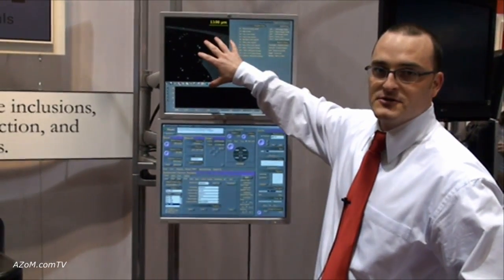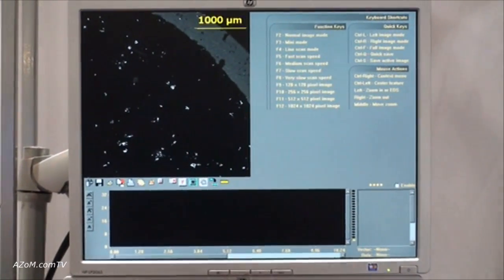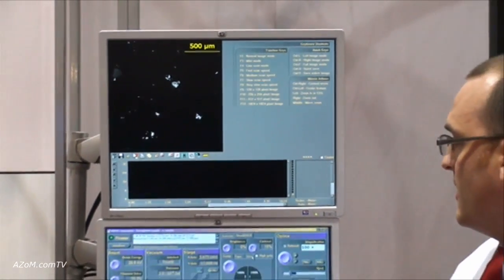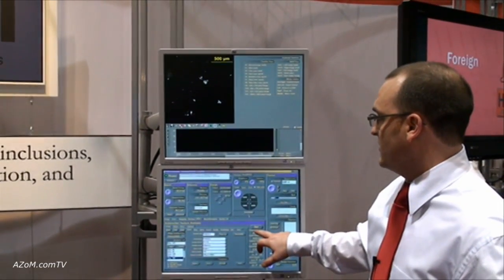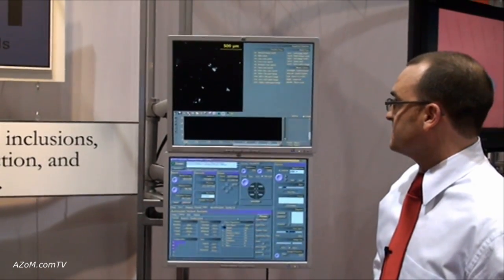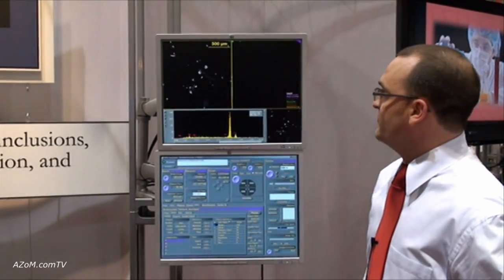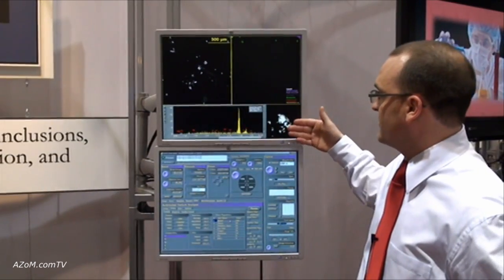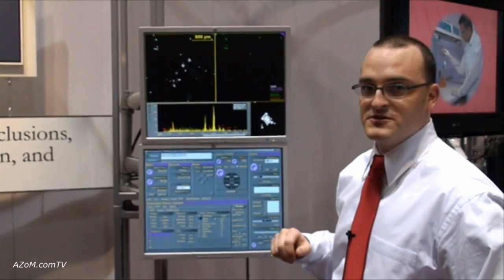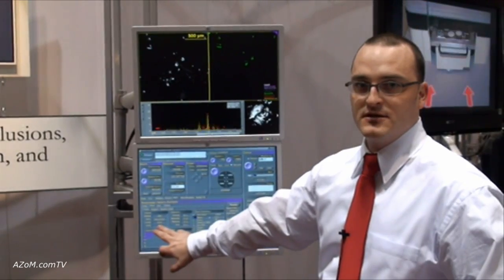You can see the particles on the sample. The idea is to perform size and shape analysis of these materials and identify what types of materials are present. Hitting the Go button starts the analysis live — the stage moves to the first position, begins detection of features, sizes and shapes each particle, and the elemental composition pops up identifying elements and tracking particle types using user-defined rules.